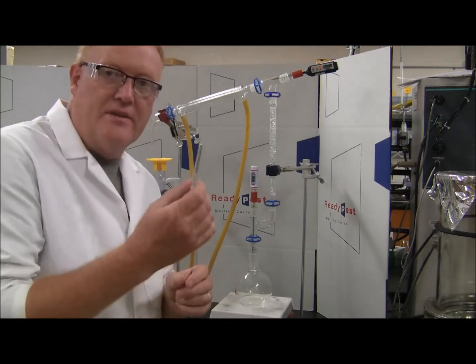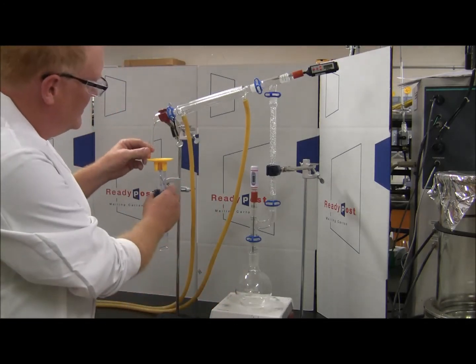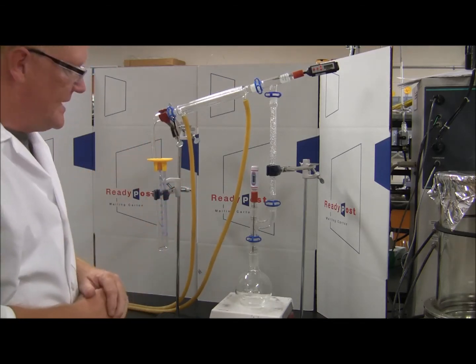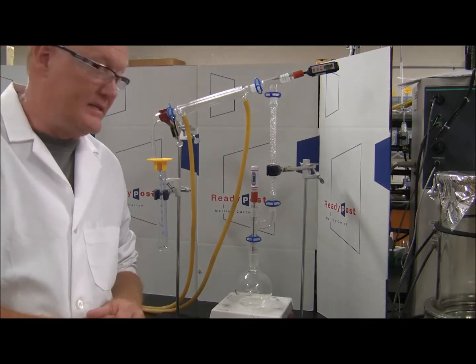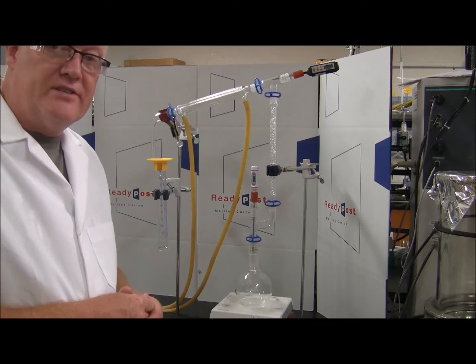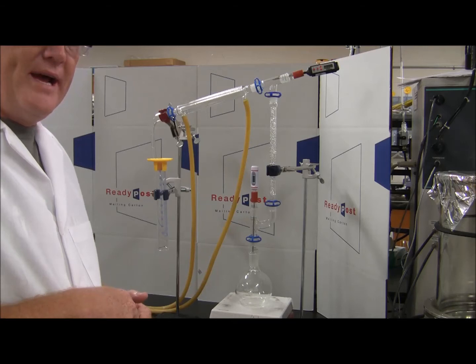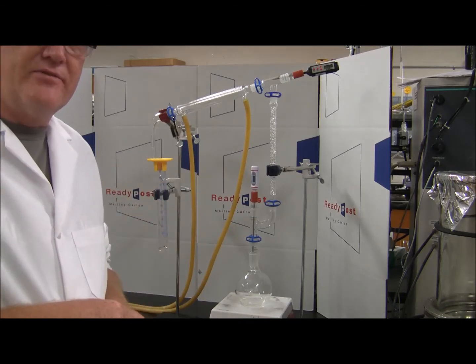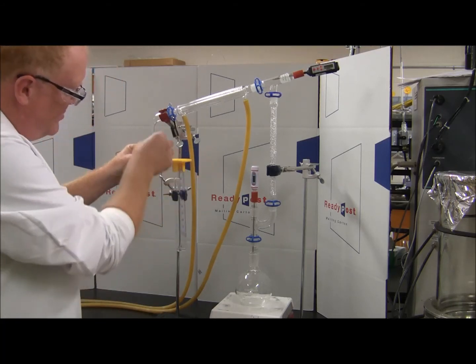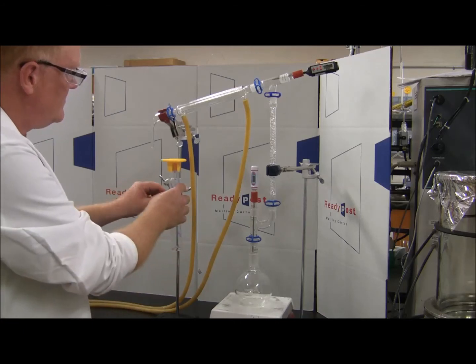The last glassware, and this is not included within the kit, are small test tubes. We can put these test tubes right here at the outlet of the distillation apparatus and use the upside down graduated cylinder as a base. You're going to collect the first 2 milliliters, then the next 2 milliliters, so you'll need 2 small test tubes for that. We'll later check those for ethanol content. As you do that, get ready to put the next one in so you're not dripping any of the ethanol out.